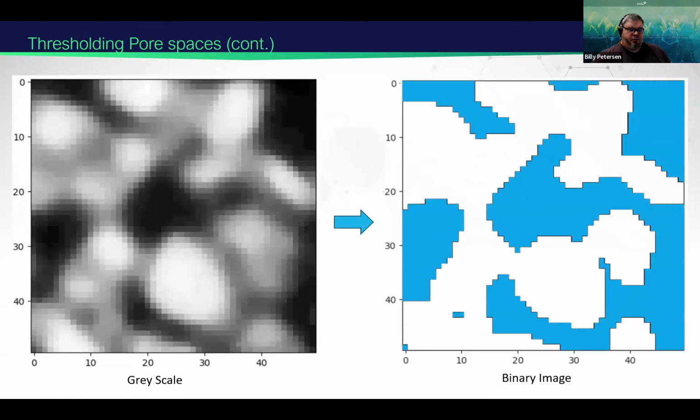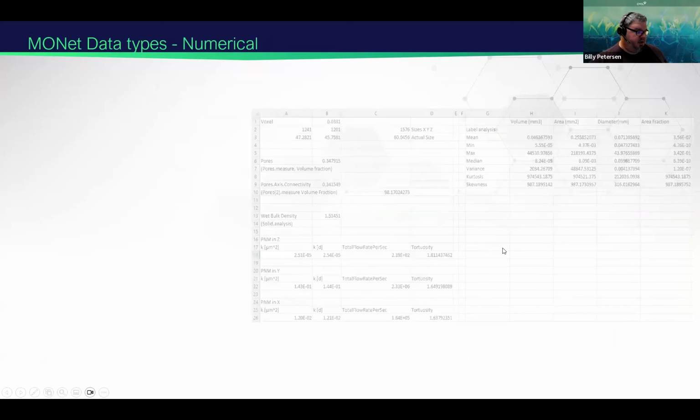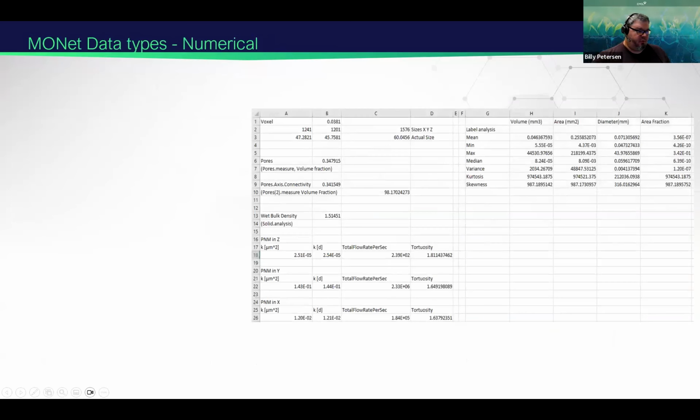Alrighty, and this is kind of a cool thing I did here to give you an idea of how that is done. So you see, here we have this area versus this area here. So these might be two objects that are different, but at the same time, you're looking at the rate at which these go down in their intensity level and then come back up. The computer makes a determination that, yeah, I think these are connected, versus right here, where we might say, hey, there's probably something there, but the computer will make the determination based on your thresholding. It's a pore.